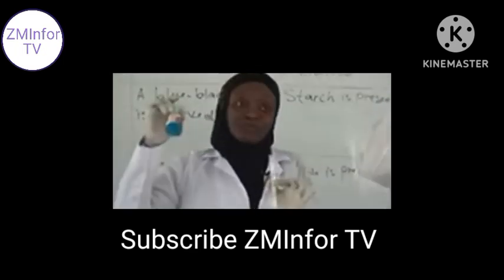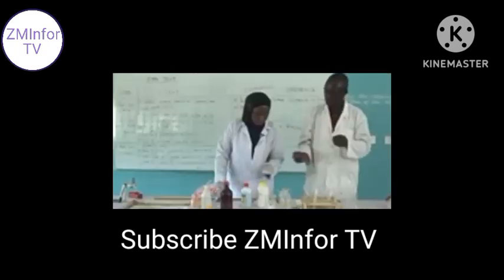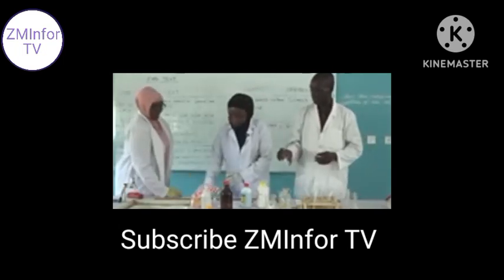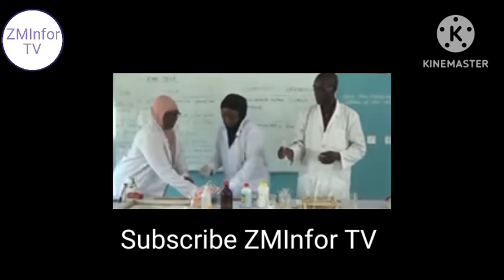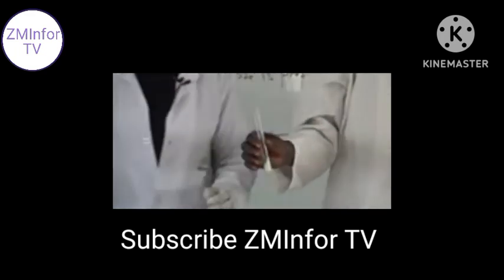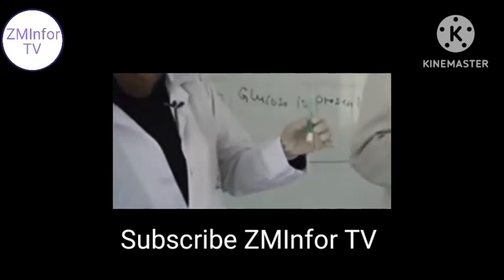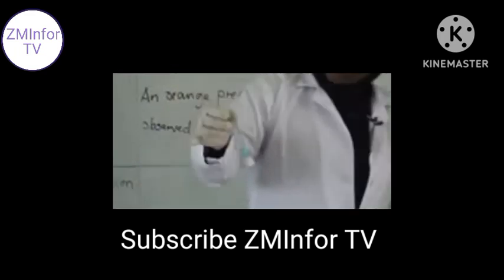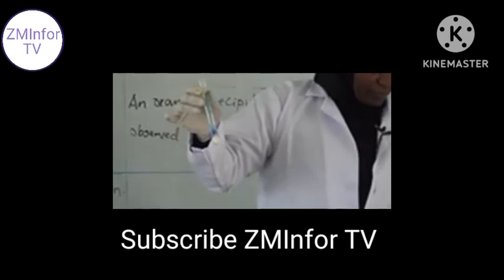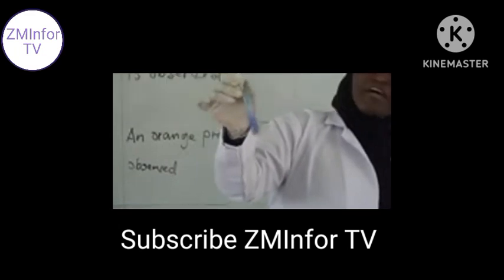This is copper 2 solution. We'll still add to it. Now let's see. You have to keep observing. We shake, and what color are we seeing?